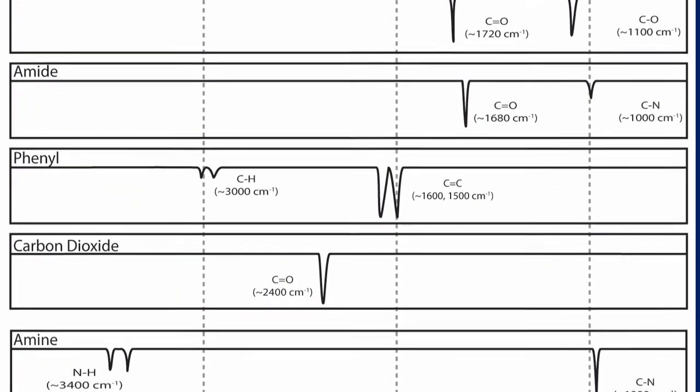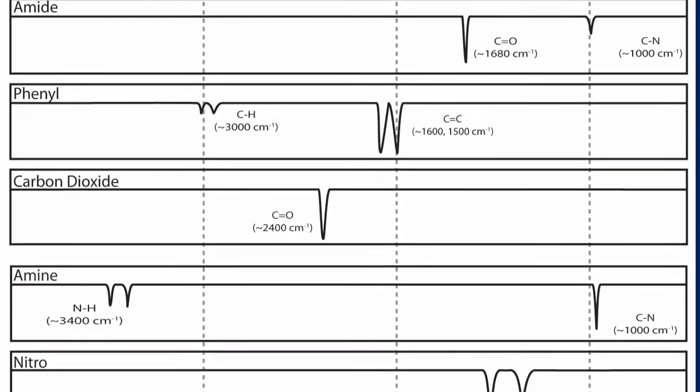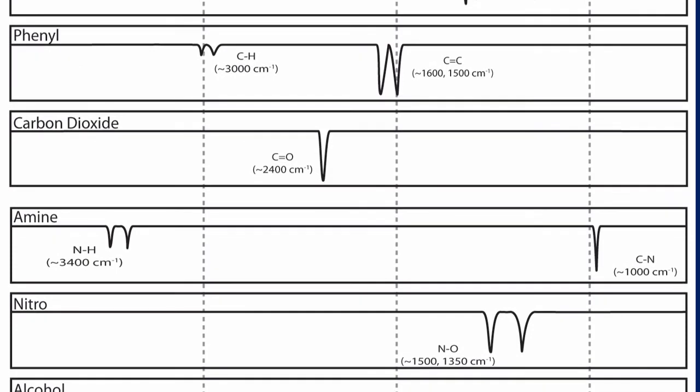There's a correlation table of these spectra available in your lab manual that shows some approximate locations and intensities of peaks that you might encounter.